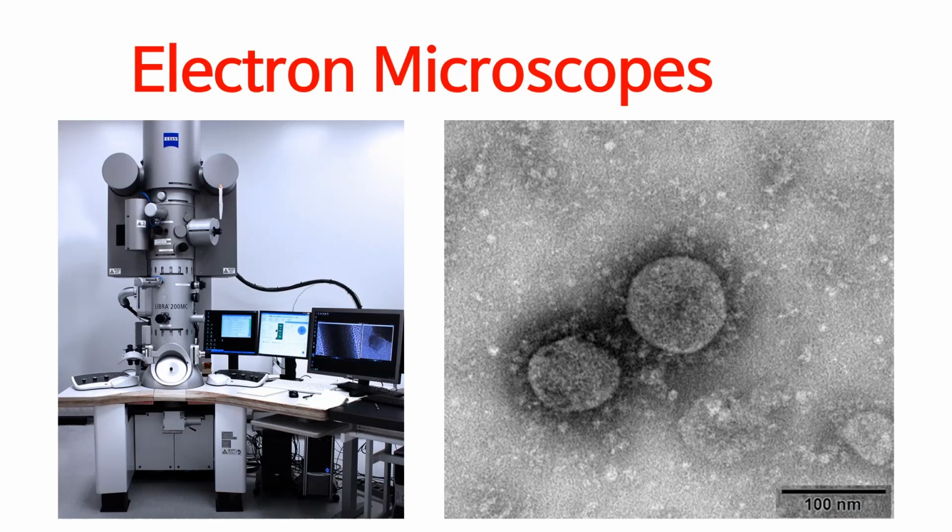The other way is to see the object by detecting the electromagnetic waves which are transmitted through the object. In the X-ray CT, by detecting the transmitted X-ray through the body, the inside of the human body can be seen. On the other hand, in the transmission electron microscope, an image of the inside of the object is created by using the transmitted high-speed electrons.